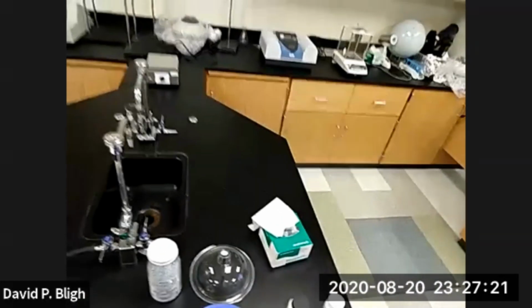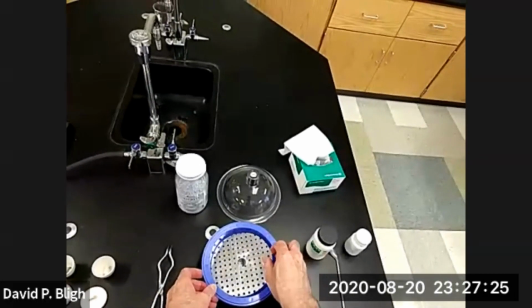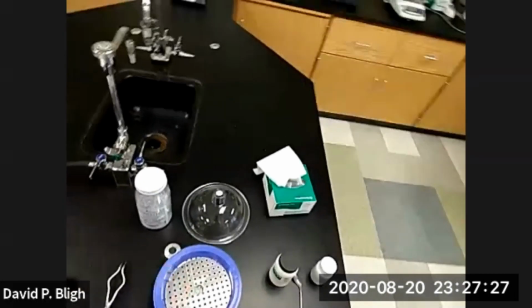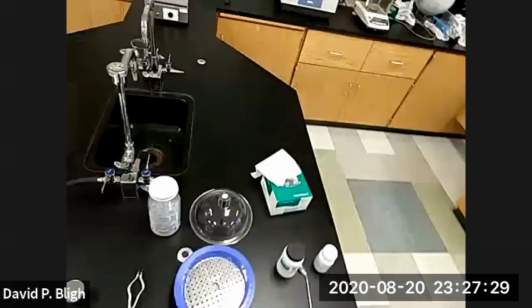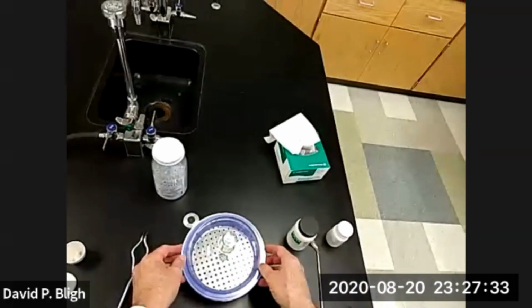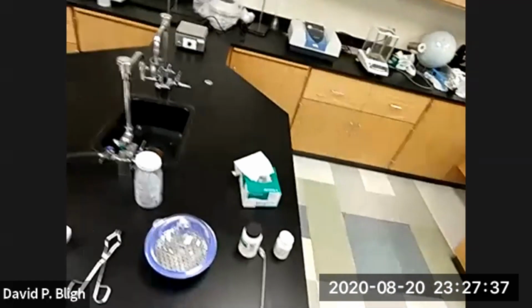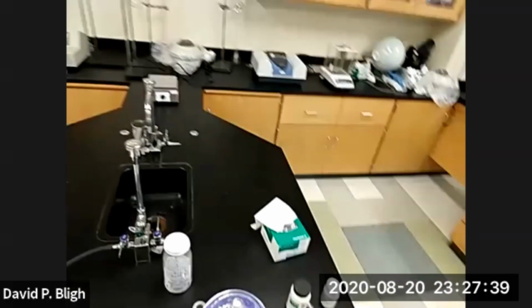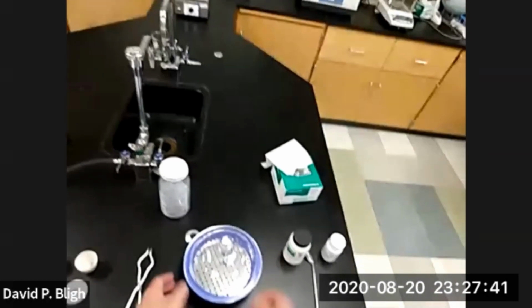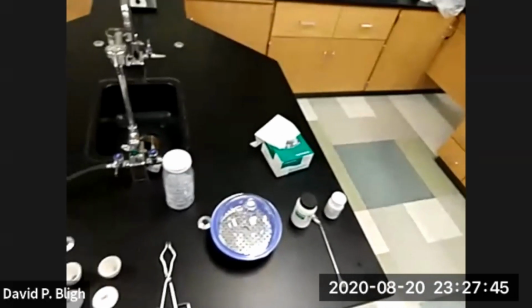Same stuff that's in the walls in your house, gypsum board. But right now, it's blue because there's an indicator in there. And when that indicator turns pink, that means it's absorbed all the water that it can handle. But at this point, our desiccator is set up so that we have a dry atmosphere in there now.